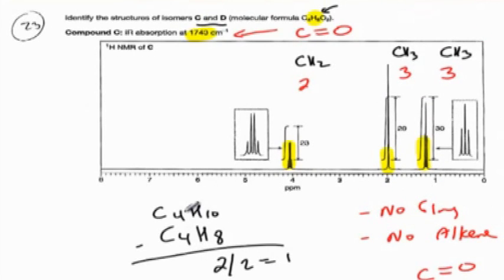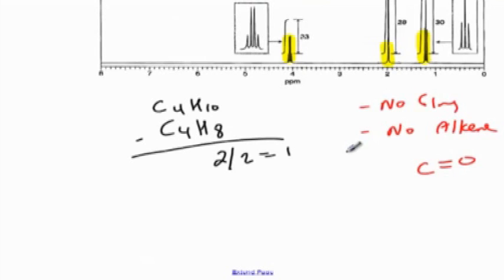And I know I have 4 carbons. I already figured out from this that I have these groups here by just working with the integration numbers, right? I'm not even looking at the splitting yet. I don't care about that because I have so much information ready to get started. I have 4 carbons, and 3 of them are taken care of here. And actually, I know the 4th is that. And I also know it's not an aldehyde, right? So let's do a quick check: is it an aldehyde? And the answer is no.